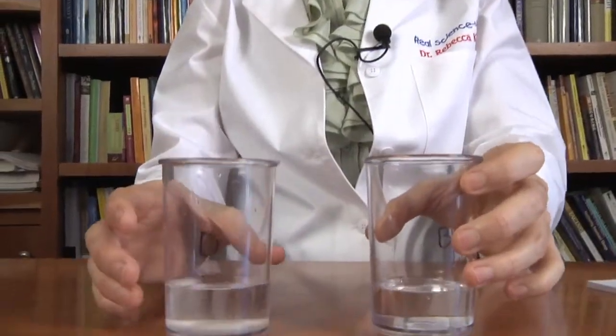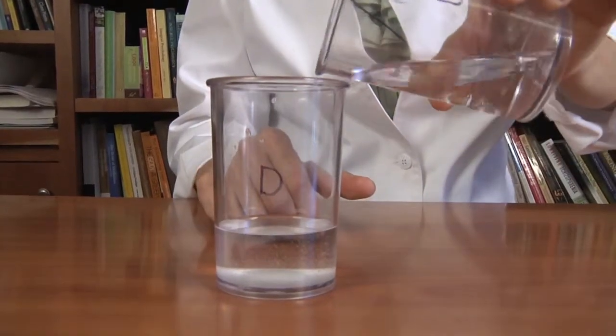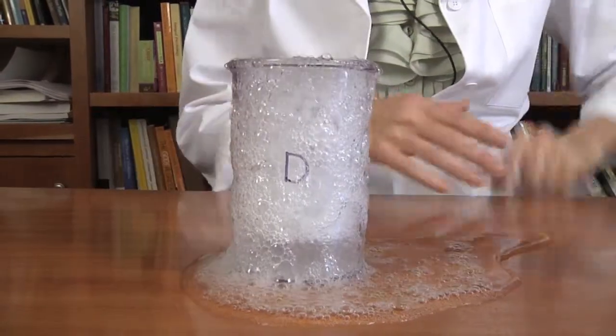Just like when we added A to C, but it's a little different — it's not quite the same. The clumps are a little bit smaller. Now let's see what happens when we add B to D. I think when I add B to D, there's going to be another very big reaction. Are you ready? Woo! Yes, another big reaction.